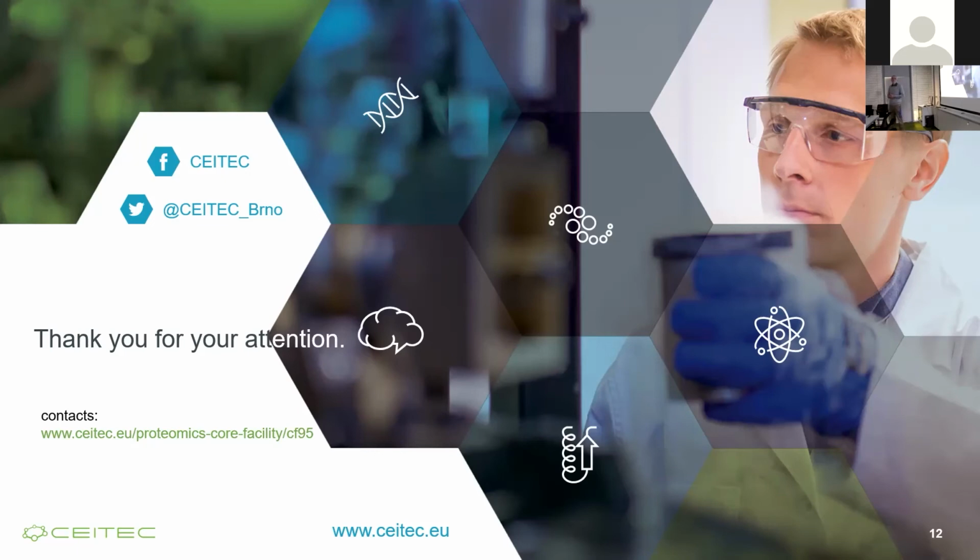I am a little bit skeptical about this. I don't know. Maybe it's so difficult that it has no sense. But I can imagine they have it also on some machines, if they run in service mode. For example, if someone is coming using AUC from Prague, then they measure by themselves and they evaluate by themselves.